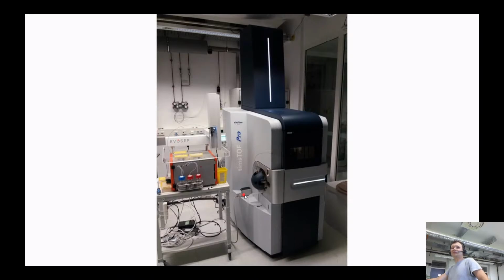That's very simple, but there are actually some tricks related to this. So on one conference, on one workshop, I was asked a tricky question. Imagine that we calibrated this instrument. Calibration, what does it mean? If you give this device a sample consisting of different molecules, let's say masses of 100, 200, and 300 in certain concentration ratios, we expect that this instrument will build us a spectrum which is going to have masses 100, 200, and 300 with expected intensities.